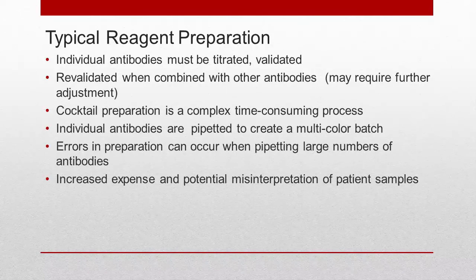Typical reagent preparation involves taking individual antibodies that must be titrated and validated. These antibodies are re-evaluated when combined with other antibodies that may require further adjustment afterwards, as some antibodies do interact with others, causing undesirable reactions.